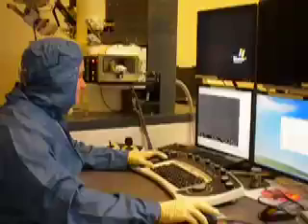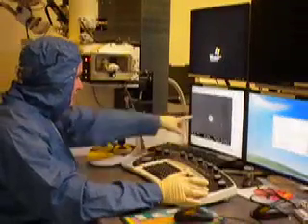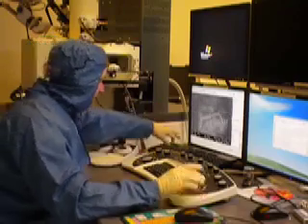We'll turn on the electron beam. The system will run up now. It's going to start to scan the sample. A little spot will appear for a second. That's the detector. And now we have an image. Right now the magnification is right around 41x. So you can get a very low magnification image with the microscope.